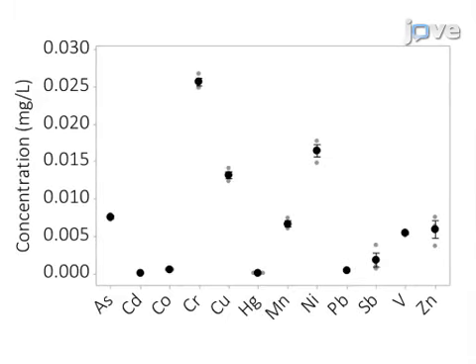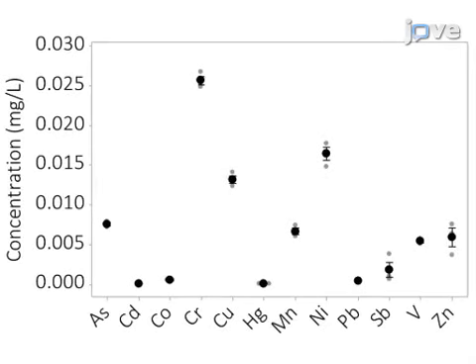Results from triplicate PBRs for batch number 1 show that most contaminants were localized to the biomass rather than the supernatant, with several sample concentrations close to the MRL of the instrument. Results for all 4 batches are presented here.